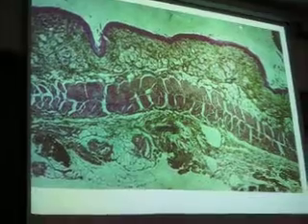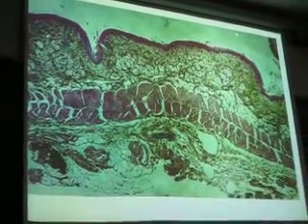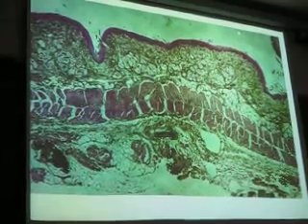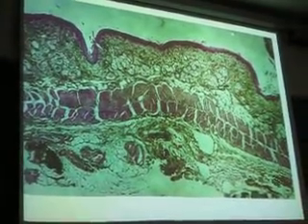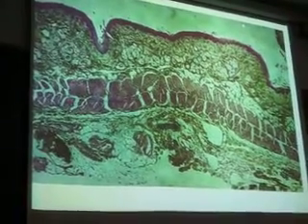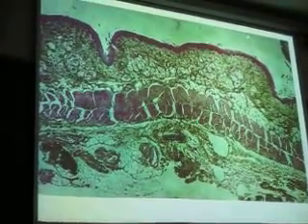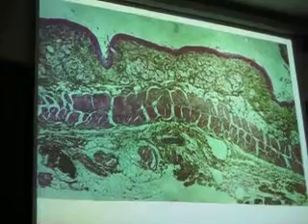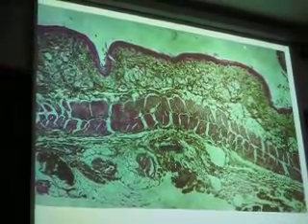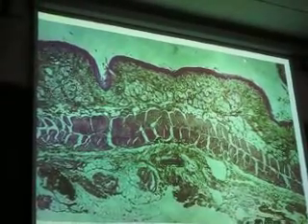It's okay, you guys can guess. I'm not testing you. The esophagus. Why do you say the esophagus? You see stratified squamous there at the lumen, so that should be number one, right? That lumen is somewhat convoluted, so since we're not zoomed in very well, you might say, hey, it's kind of confusing. It kind of looks like the mucosa is folded, right?